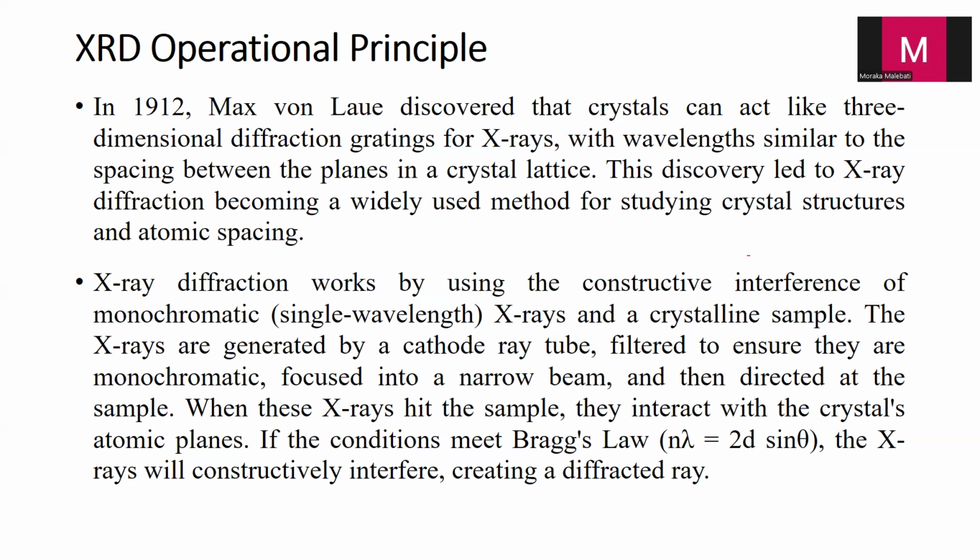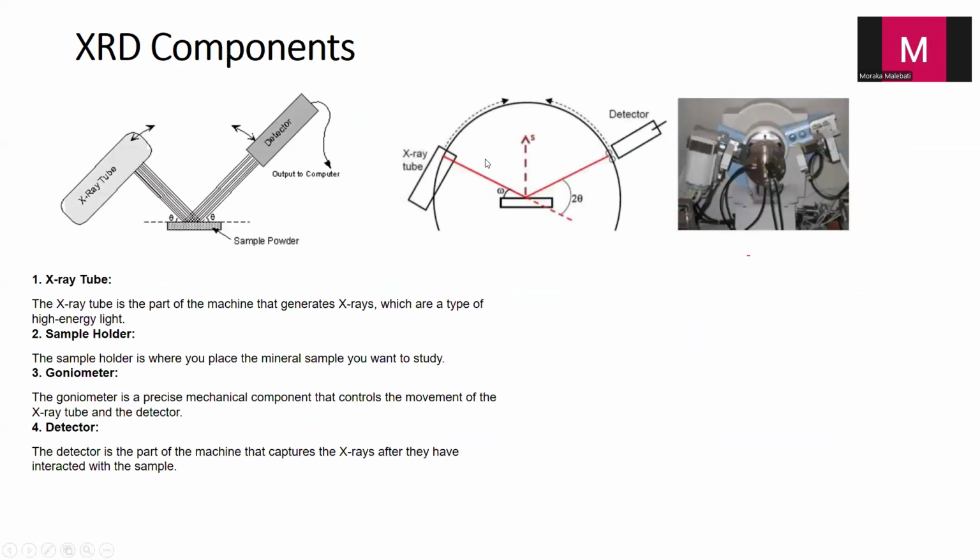I hope it makes sense. So you now agree with me that the X-ray diffractometer setup has been designed so that the sample is rotated in the path of the focused X-ray beam at a specific angle.